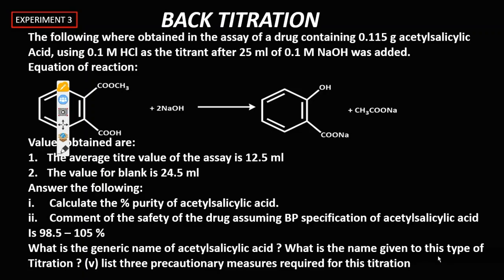Alright guys, so in this particular one, this is the back titration, the same thing that we just did. But now, if you are going to see that practical in exam, this is exactly how it's going to be. They already gave you everything you need. Right?